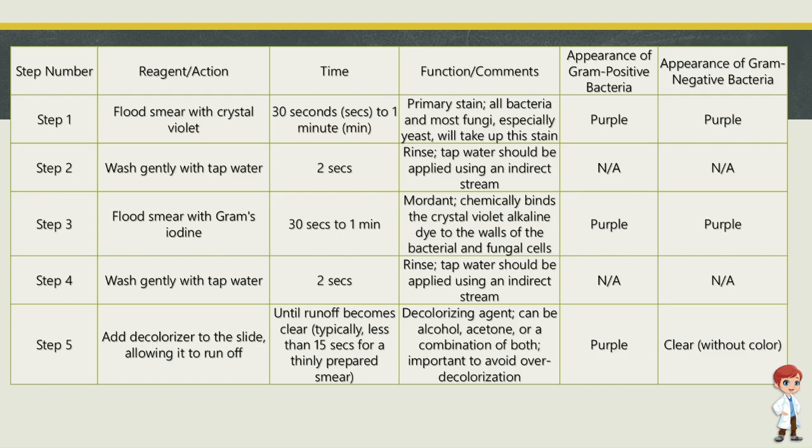Step 2. Reagent/action, wash gently with tap water. Time, 2 seconds. Function, rinse, tap water should be applied using an indirect stream.